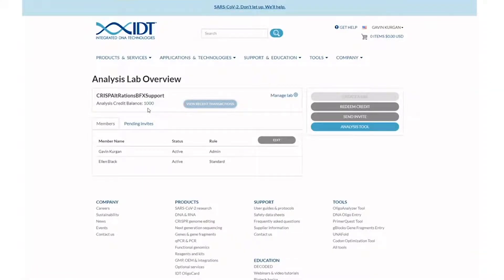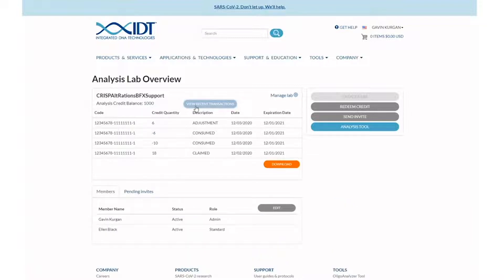You can view your current balance in the top left corner or view your transaction history. At any point, you can refresh the page to see an updated account balance.